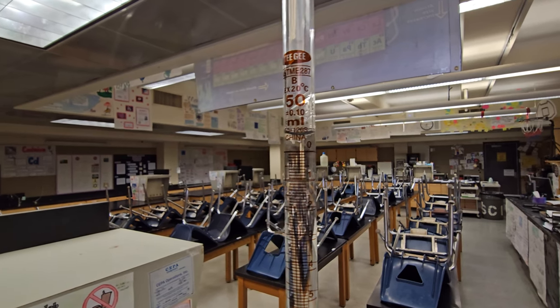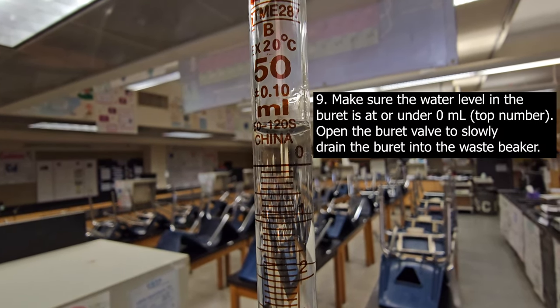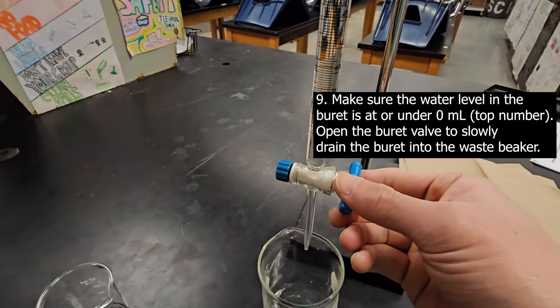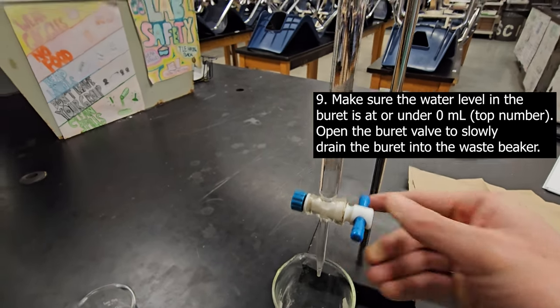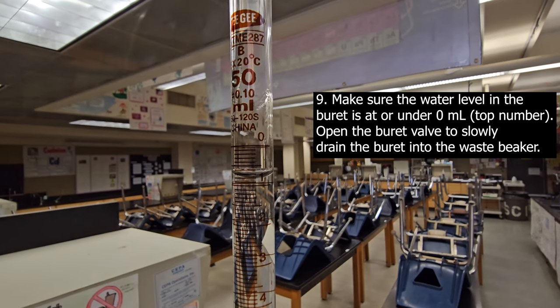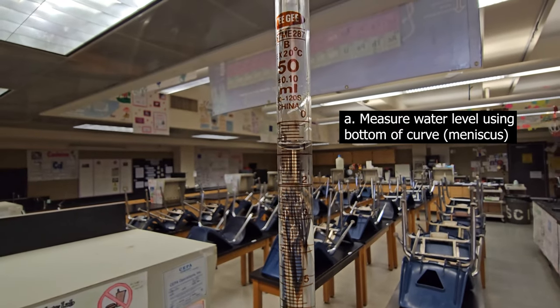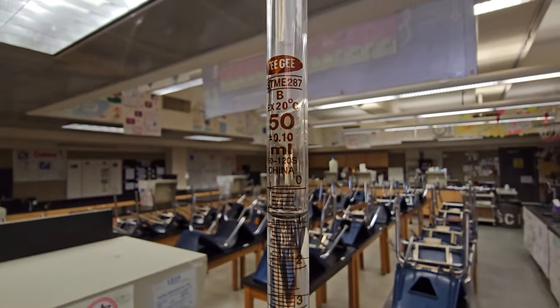For this next part, make sure the water level in the burette is at zero. If the water level is above zero, you can't start measuring there, so slowly open the burette to drain a little water into the waste beaker until the level drops to just below zero. For example, the water level here is about 0.8 — anything under zero is fine. Take note of whatever number you land on, as you'll use it as your starting point.